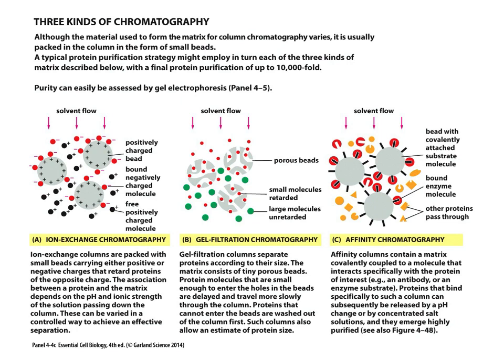Okay. Another type of chromatography is gel filtration chromatography. And so in this case, we're going to have beads that have holes in them, and those holes can be different sizes. And so the proteins, the molecules, have to be a certain size in order to get trapped into the beads. So that means larger molecules would be able to move through that gel. They would not be trapped in the beads, so they would be collected first. You would then add a wash, you would add a solution that would allow for the release of those molecules in the beads.